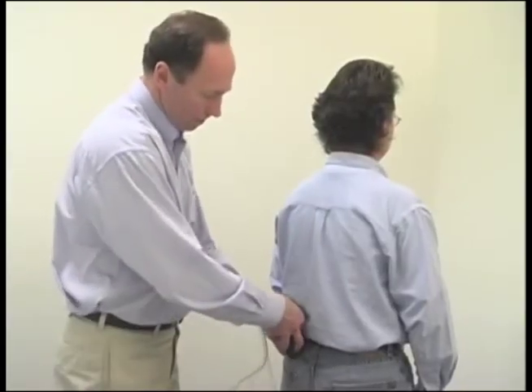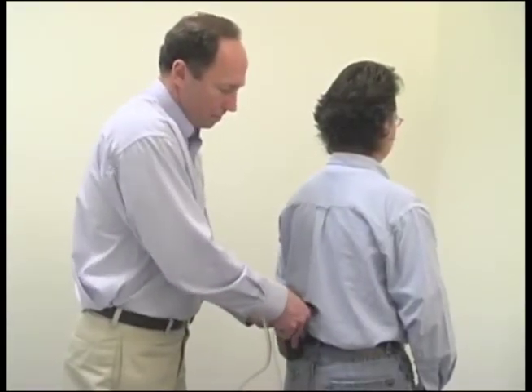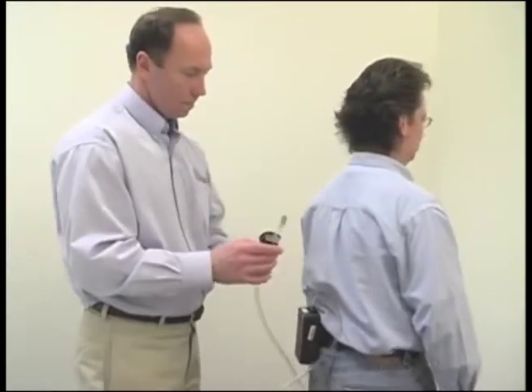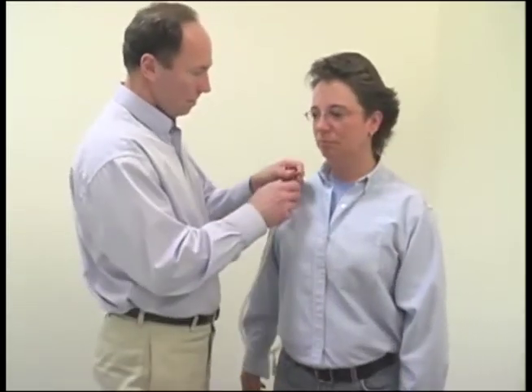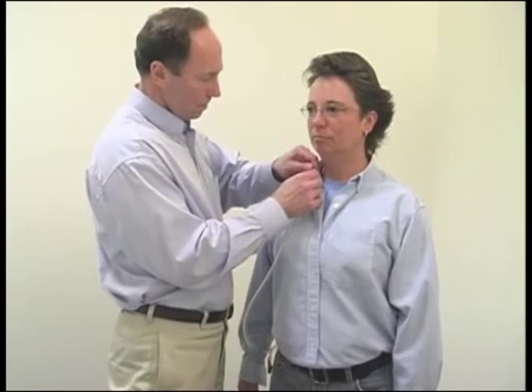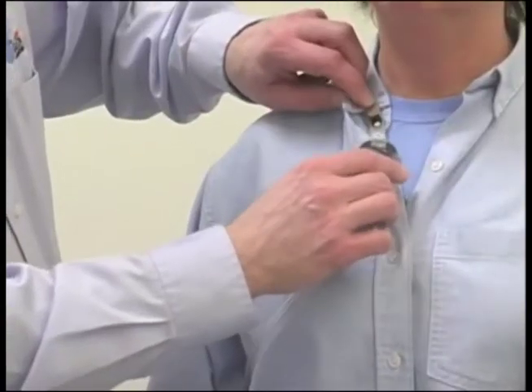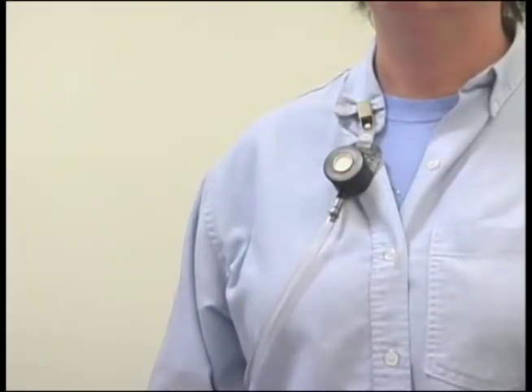Attach the pump to the worker's belt or pocket either in back or on the side. Bring the tubing to the front of the employee. Clip the IOM sampler onto the worker's clothing in the breathing zone. Remove the transport cover from the inlet of the IOM sampler.